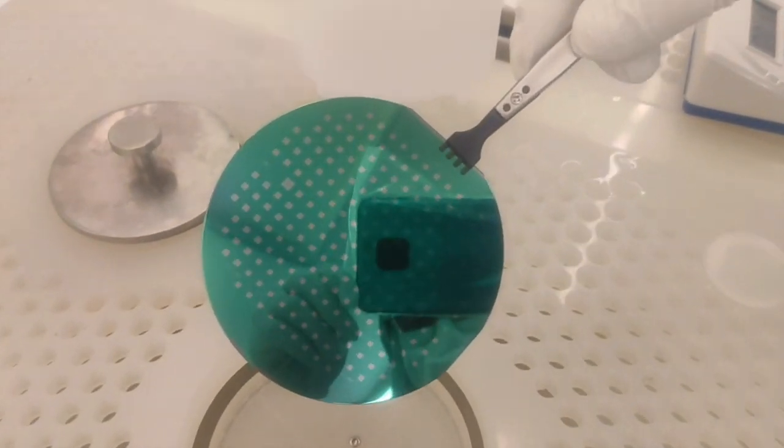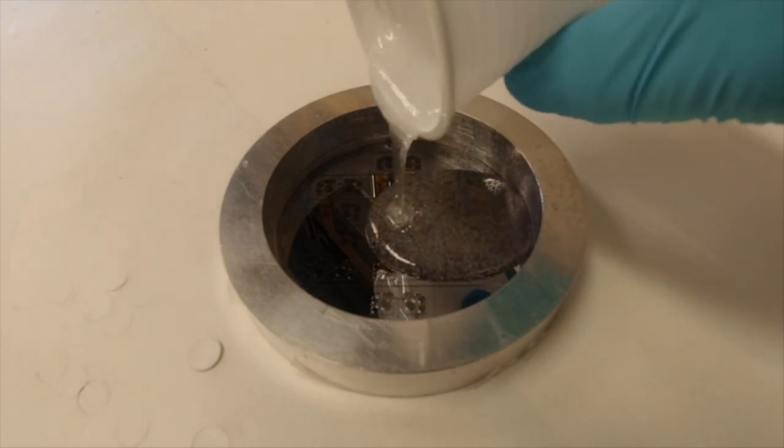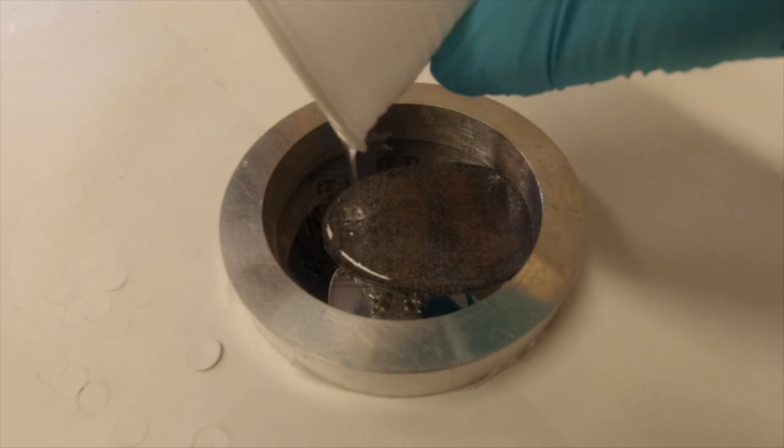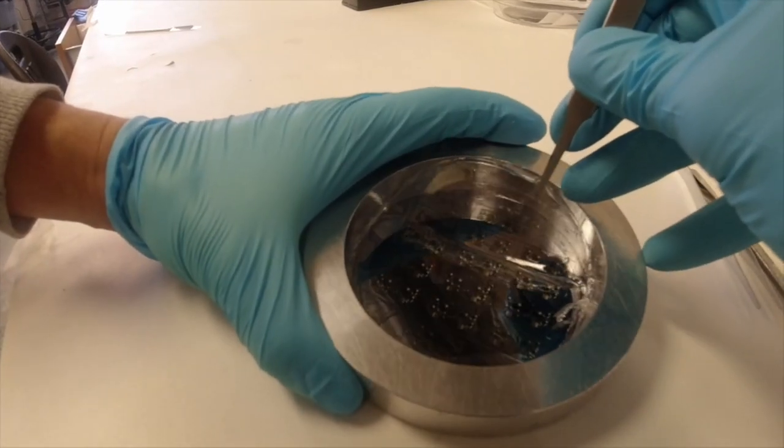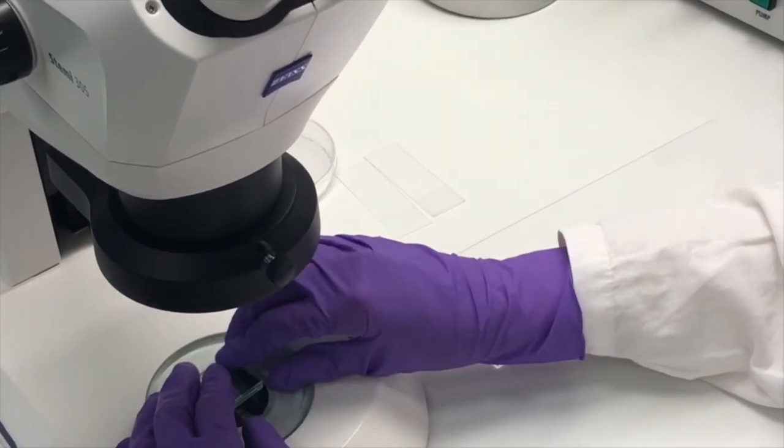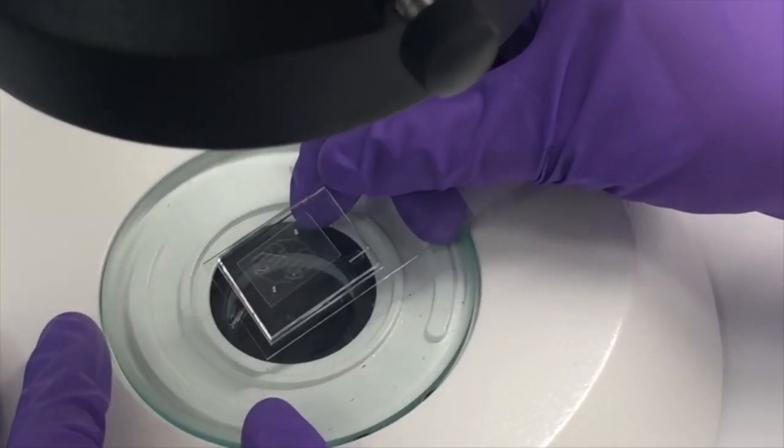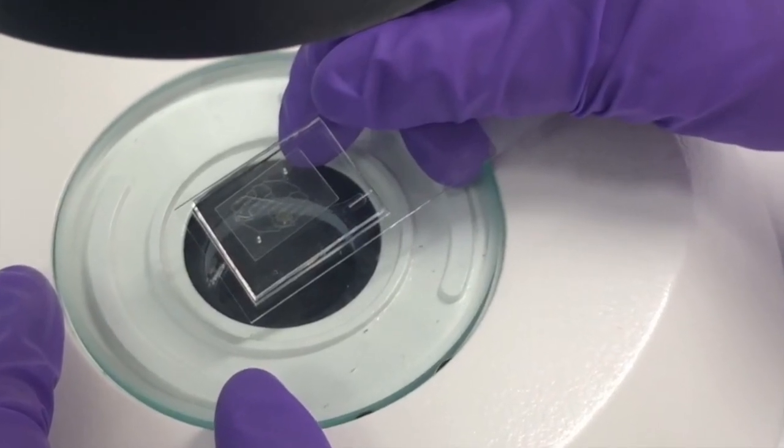This plastic mask can then either be used as a mold, where for example PDMS can be poured into, or to directly etch into the material, like silicon or glass. After the PDMS has been cured, it can be peeled off the mold, and after activating the surface with oxygen plasma, it can be bonded to a glass bottom. The channels that were molded into the PDMS are now closed off by the glass.